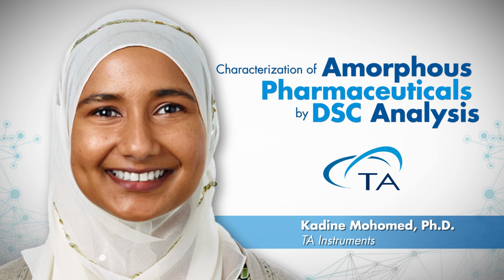Okay, so with that question, you should ask first, do you want to test your sample with a hermetic seal or without a hermetic seal? Amorphous solids may contain a certain amount of adsorbed water that can possibly plasticize the Tg. If you are interested in knowing what is the glass transition of a dry sample, then testing with a non-hermetic lid or no lid would be your option. So you can either dry the sample outside of the DSC or in the DSC by doing a heat-cool-heat. The first heat dries off the water. The second heat gives you the glass transition of that dry solid.